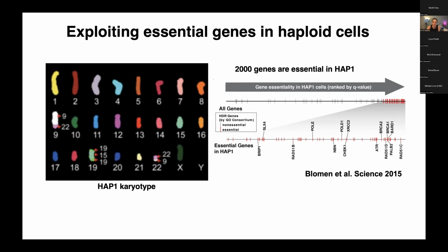The labeled genes on this plot are on the University of Washington's hereditary breast and ovarian cancer risk panel. And between them, there are thousands of variants of uncertain significance that could be used for clinical variant interpretation. So we take advantage of this line for saturation genome editing, and Moez will tell you more about it.